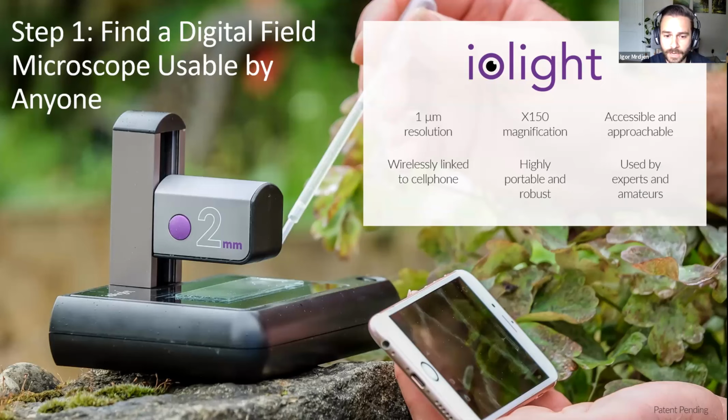But basically, these are small, pocket-sized, almost digital microscopes that link wirelessly to your phone. They have about a 1 micron resolution and roughly 150 times magnification, meaning that they have just enough resolution and magnification to see cyanobacterial colonies, but not too much where they become finicky and difficult to work with. And so because of that, they're really accessible and approachable for use by experts and amateurs.